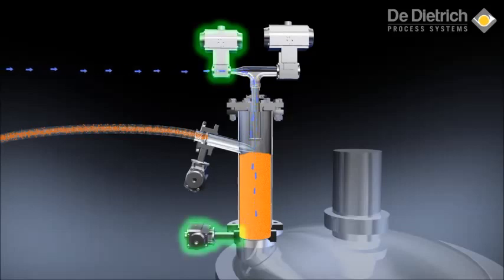Following another brief delay, the powder outlet valve opens, and the pressurized nitrogen helps discharge the solids into the receiving vessel. The nitrogen valve remains open to help prevent oxygenated or solvent-laden air from entering the powder pump body.